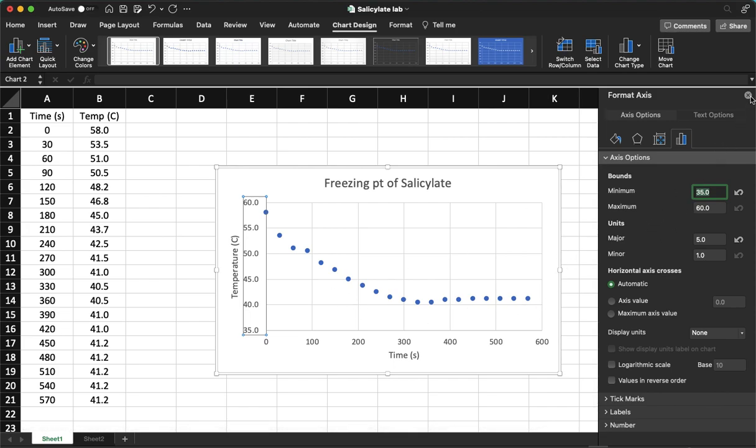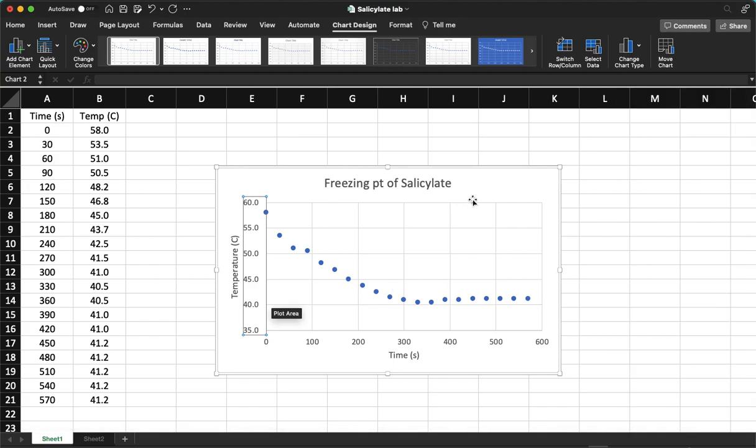And then the last bit that you have to determine from the graph is find where the plateau occurs, which for this one you can see that it decreases, and it comes up, down a little bit here, and then up, and then it kind of stays here. So this will be the flattest part of your graph, will be the temperature that corresponds to the freezing point, because we know that once a liquid starts to freeze, the temperature doesn't change until all of it is frozen. And so here's where that point is.